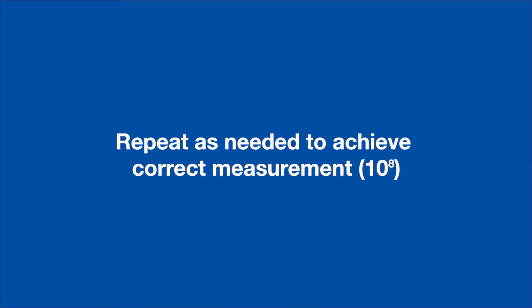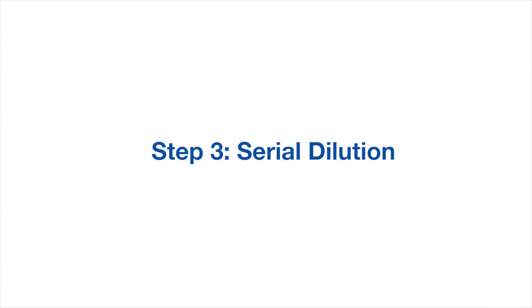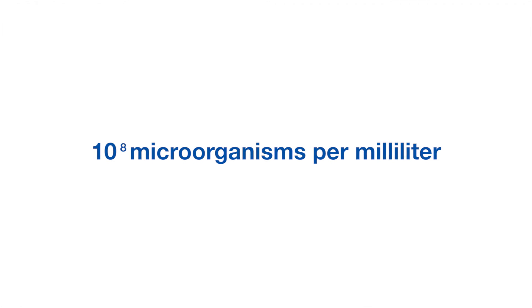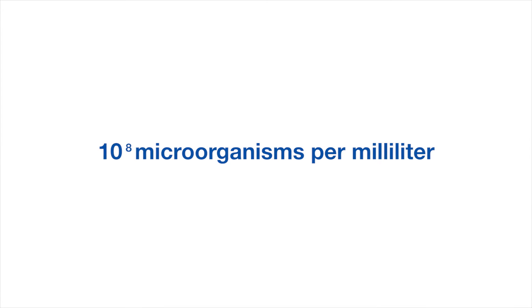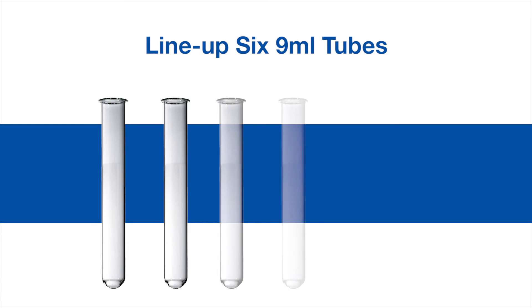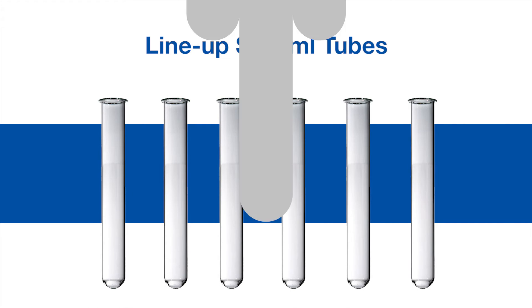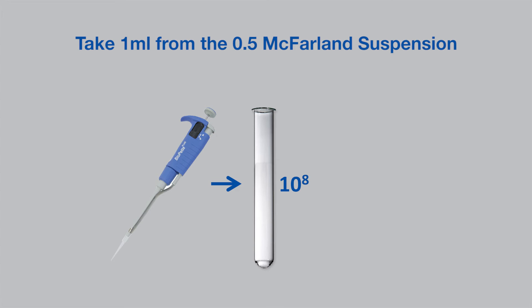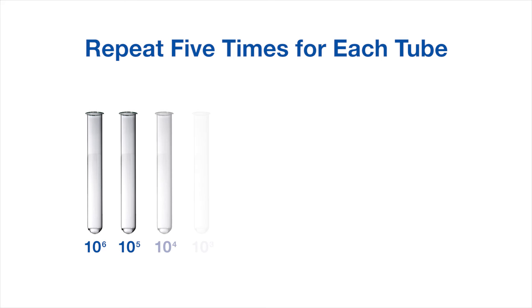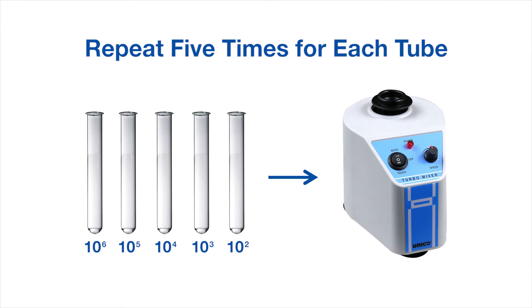When you achieve the correct density, serially dilute the microorganism suspension. The suspension contains approximately 10 to the 8th microorganisms per milliliter, and in our example you only want a concentration of 100 to 1,000 CFU per milliliter. Line up six tubes, each containing 9 milliliters of phosphate buffer. Take 1 milliliter from the 0.5 McFarland microorganism suspension, add it to the first tube of phosphate buffer, vortex the tube, and serially dilute and vortex five more times. Now you finally have the CFU concentration of 100 to 1,000 CFU you are seeking.